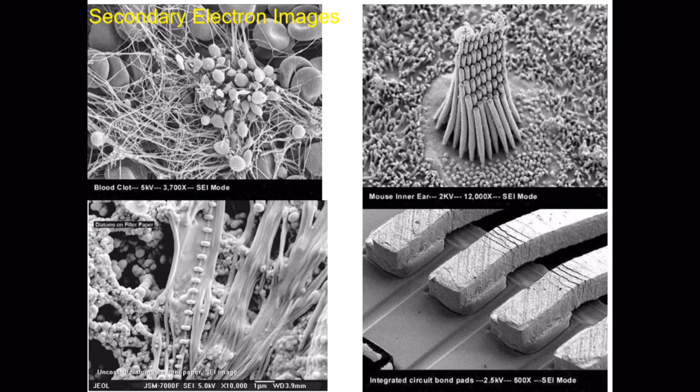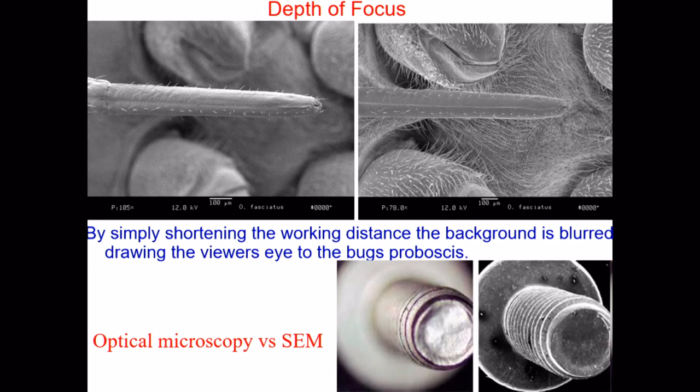Also, this is an electronic device. This is a bio one. Rods, tubes. Everything here is surface morphology. Okay. So you can see the focus of an optical microscope and the focus from SEM, and also you can change the depth of focus. This is a bio-organic one.